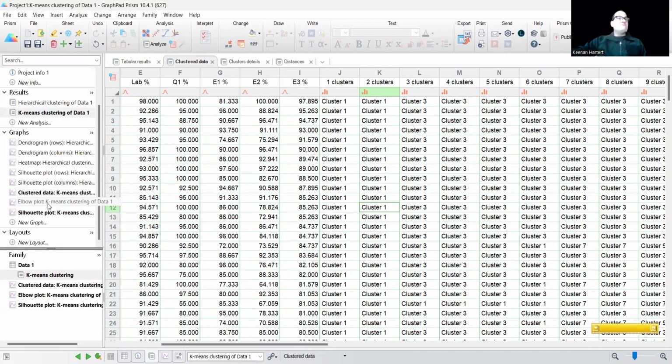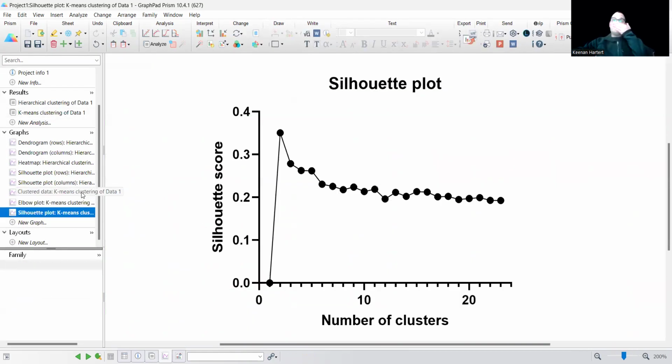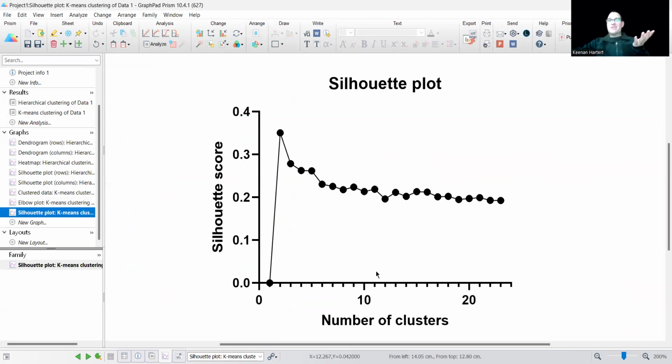All right, so given everything, let's take a look at our silhouette plot. Like we saw before, it tried a lot of different clusters. One cluster was terrible. It clearly needed to have different stuff. Three clusters wasn't bad, but two is the healthiest setup in this case. A lot of my cancer research is plugging in patients and their genes and seeing who shows up. A lot of times in what I research in lymphoma, it's going to be five clusters. But however the data shows up, it's going to be hypothesis generating. So right now I would say, all right, I am backed up by k-means that says my data is existing in two main primary groups.